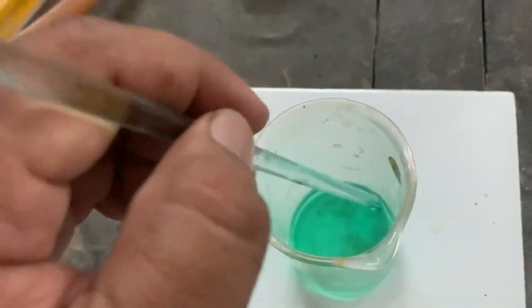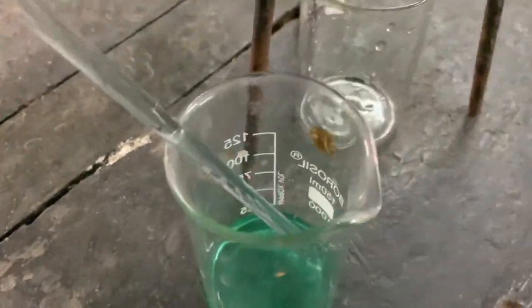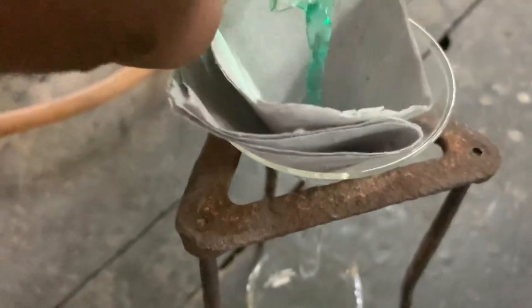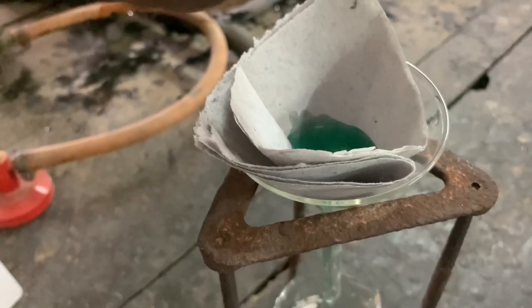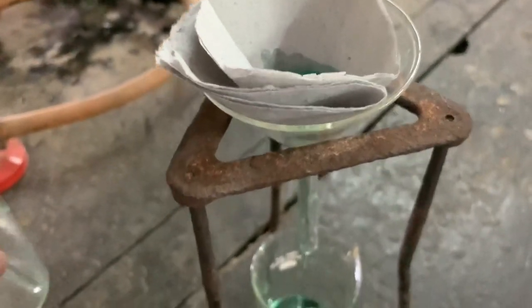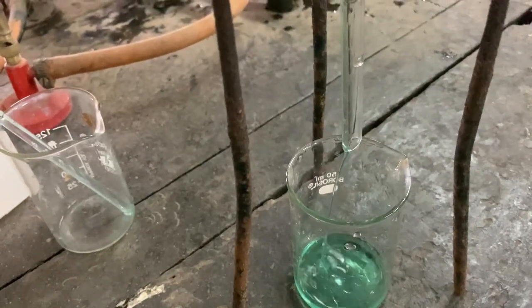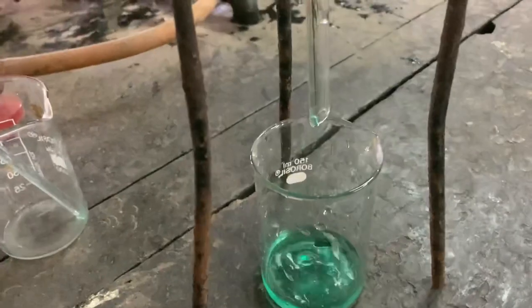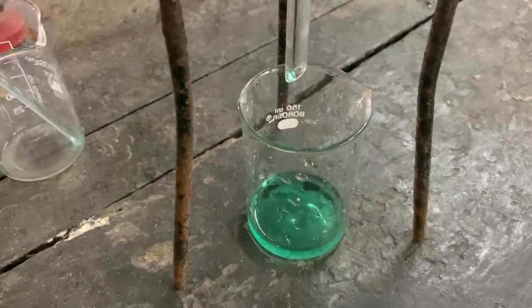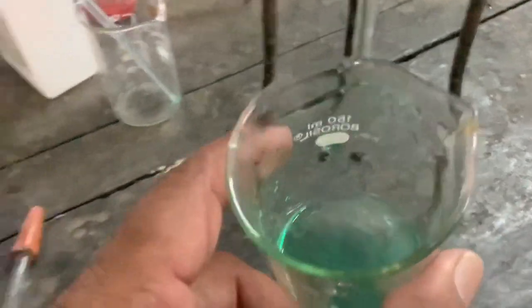so let's filter it. Okay, so this is nickel sulfate solution. We'll filter this solution. Okay, so we have just filtered this nickel sulfate solution.